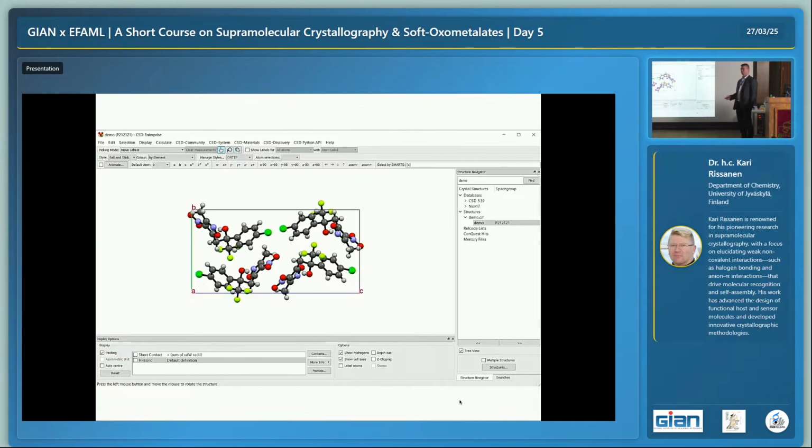And then what you can do, I will show it also very easily, is make a packing plot. So how the molecules pack. If you remember, the table says how many molecules we have in a unit cell. It says 4, and these are 4 molecules. But now if you ask how many molecules are in the asymmetric unit, because now we have 4 different coordinate sets. We have the original and then those with symmetry. So there are 3 times 2 1-screw axes, but each of them creates 1 coordinate set. It means that there is 1 molecule and then 3 coming from symmetry. So the asymmetric unit contains 1 molecule. The rest comes from symmetry.